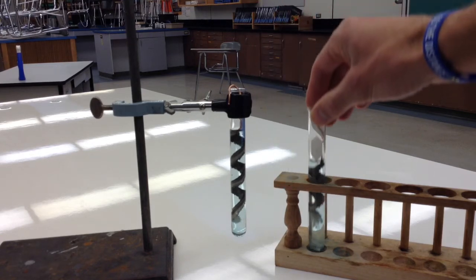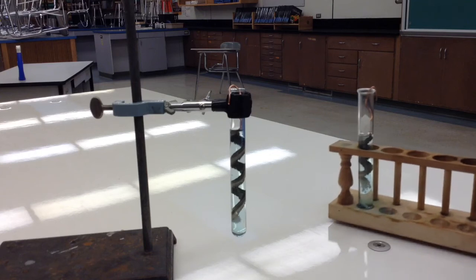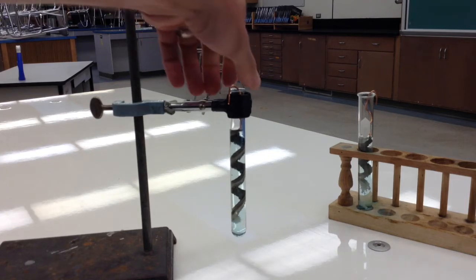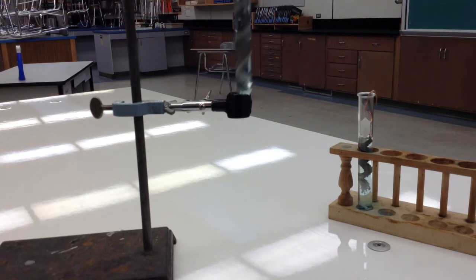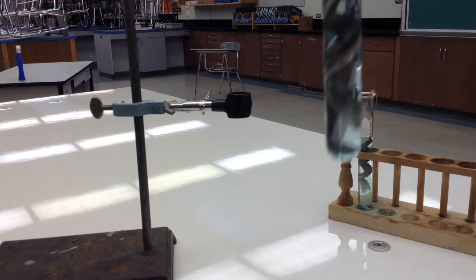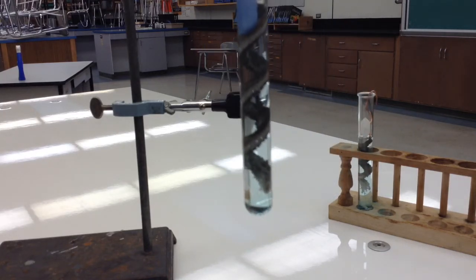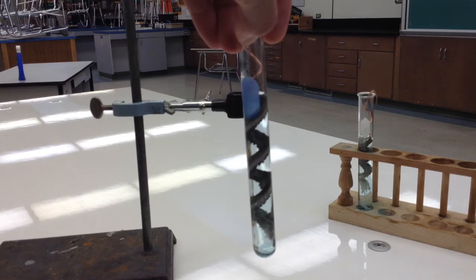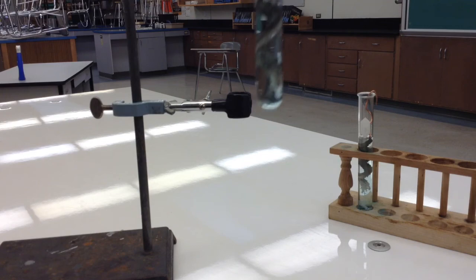Now, please note, and I know it's going to be kind of hard to tell if you can see this in the film, there has been a slight change in the color of the solution. It's become a little bit more blue. So let me draw this a little bit closer to you. Hopefully we can make that observation that it's become a little bit more blue. I'm going to turn us back around.